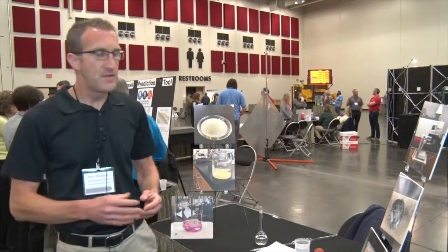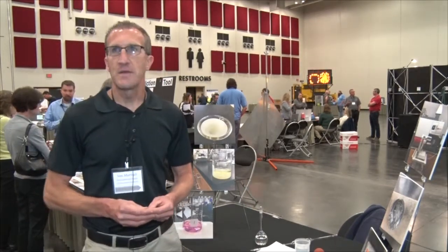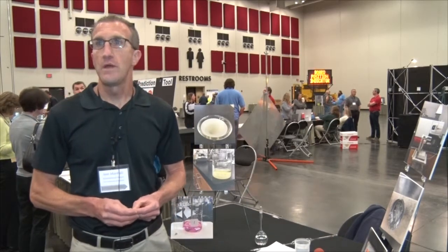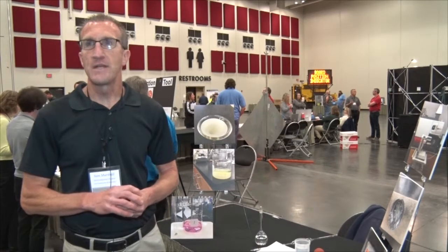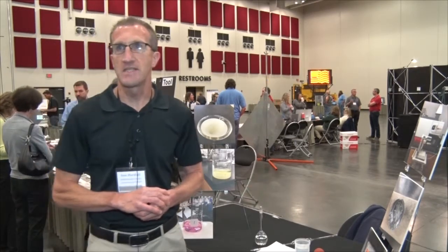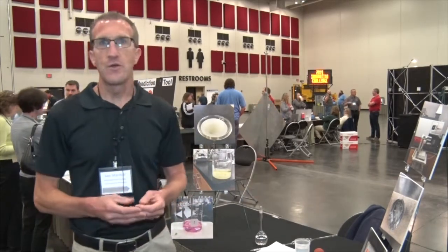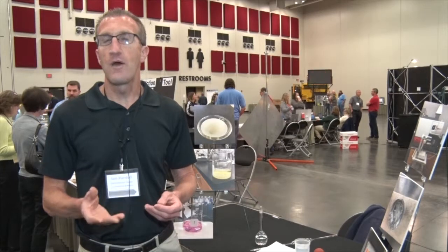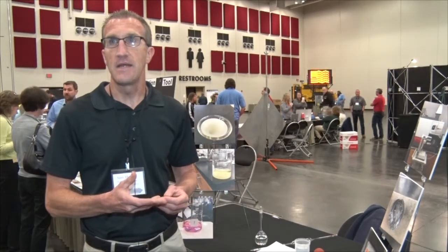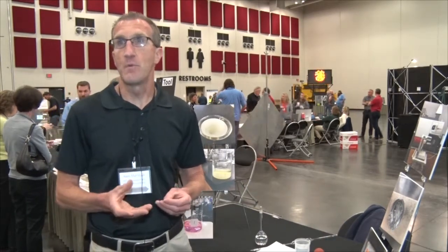I'll explain a little bit about it. High friction surface treatment is a localized treatment that is used for skid control. One of the main minerals in high friction surface treatment is a material called bauxite. It contains a lot of aluminum oxide. I've come up with a method, as currently there is no method around right now that can determine that amount of aluminum oxide in high friction surface treatment. So it's kind of an industry standard at this moment.